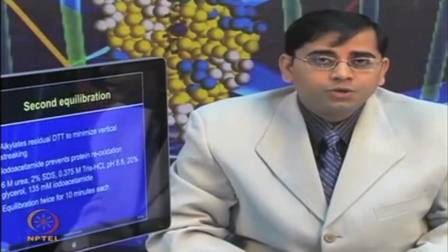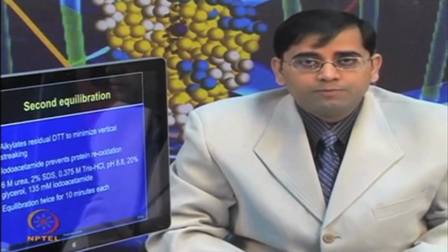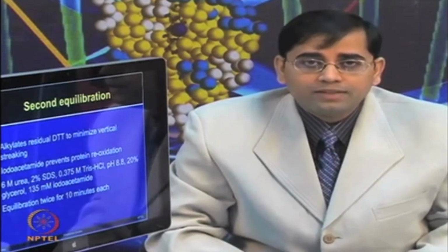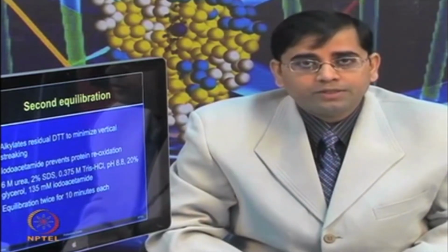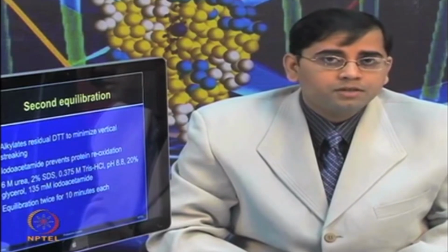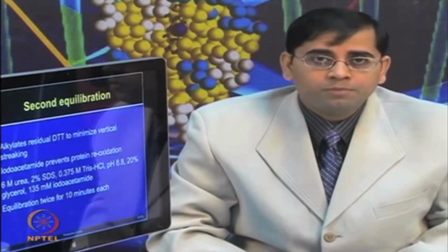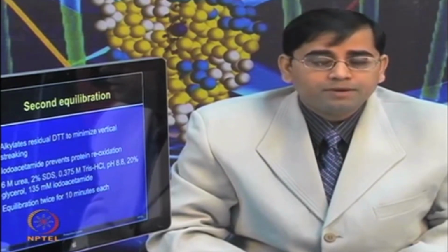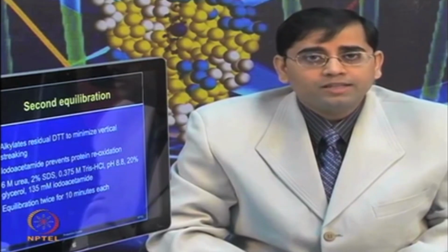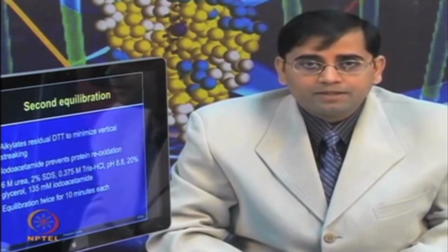So, you want to really ensure that your protein is denatured again after doing the IEF process. It is coated with SDS molecules, so that now you can separate the proteins in the second dimension based on molecular weight. This step is also performed for 10 to 15 minutes depending upon the strip length, and once both the steps are done, then you are ready to perform the SDS-PAGE.